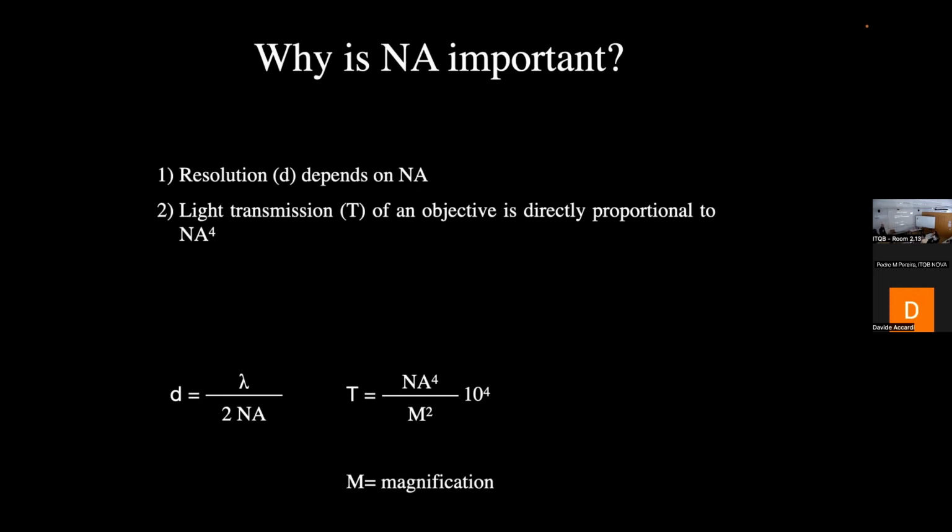So if you, for example, do a single molecule detection experiment and your molecules are sparse, the resolution limit of your lens is not actually the bottleneck of your observations. Because if your molecules are far away, and the distance, although they are tiny, is larger than the minimal resolvable distance, you will see them separated and you will be able to count them, even if you have a relatively small numerical aperture lens, if they are sufficiently far apart.